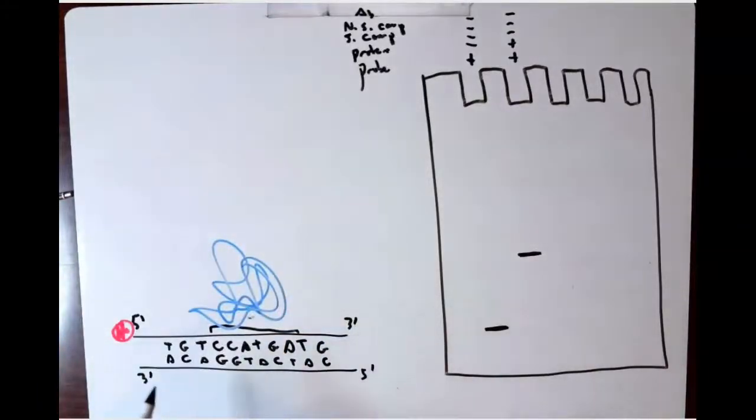So we get all excited, right? We do this and we say, oh my God, our protein binds to our DNA region. Look how amazing this is. Our protein bound to this DNA region. So then you can begin calling this into question, can't you?